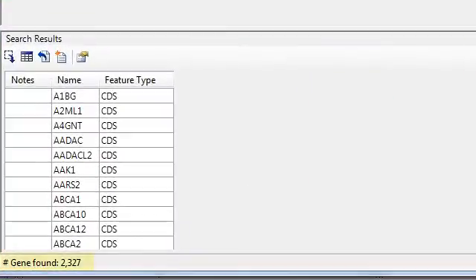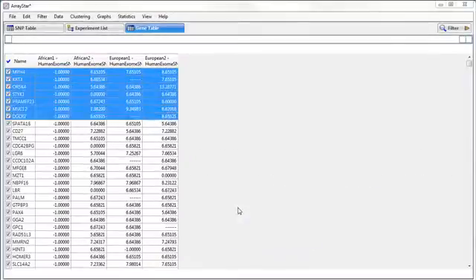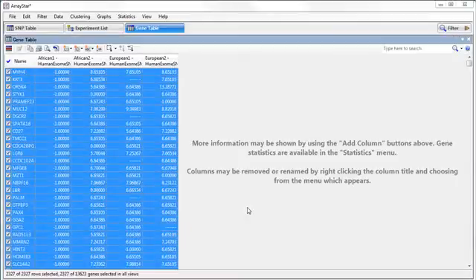and you can see that it found 2,327 genes. So I'm going to click on this button here, which will select those genes and show them to me in the gene table.